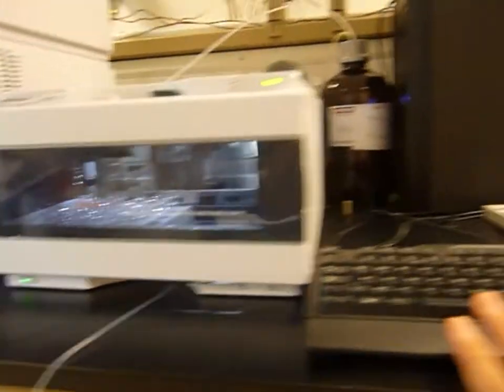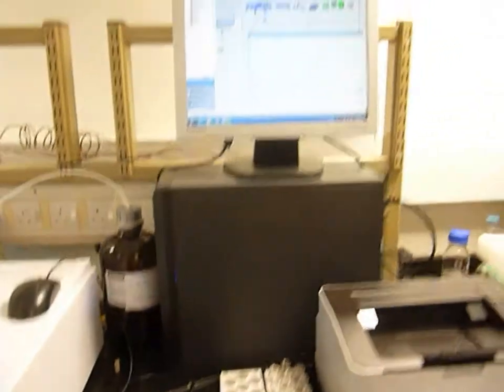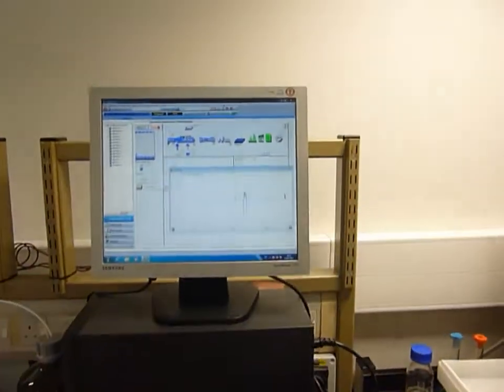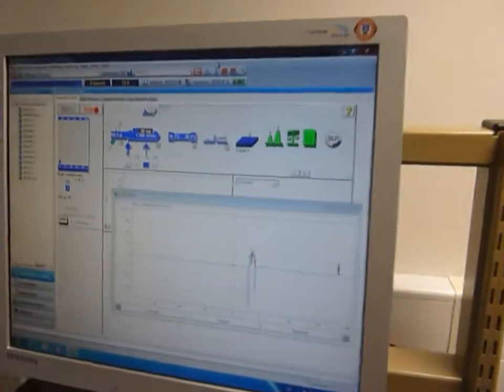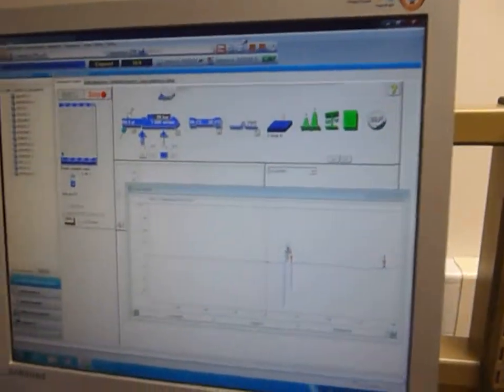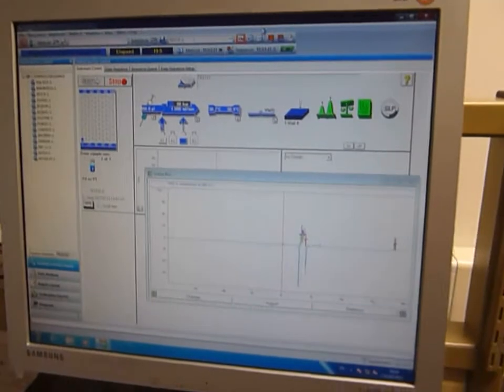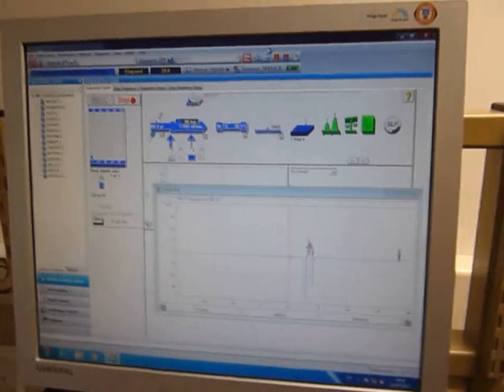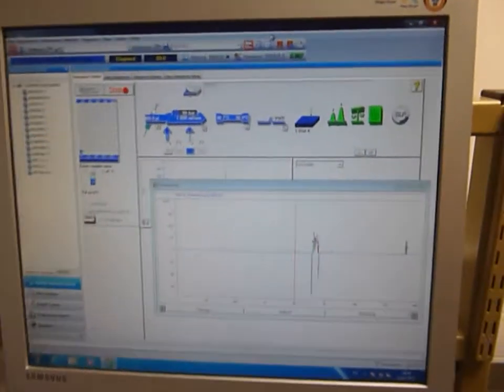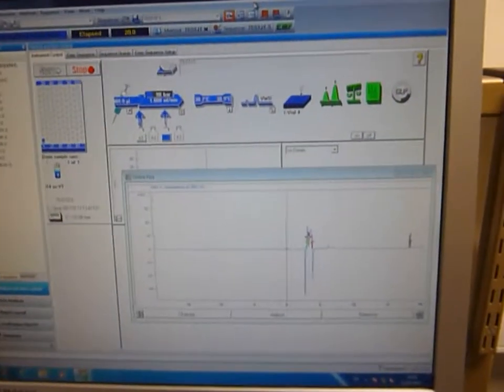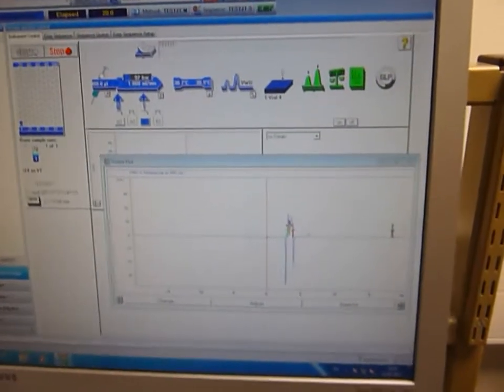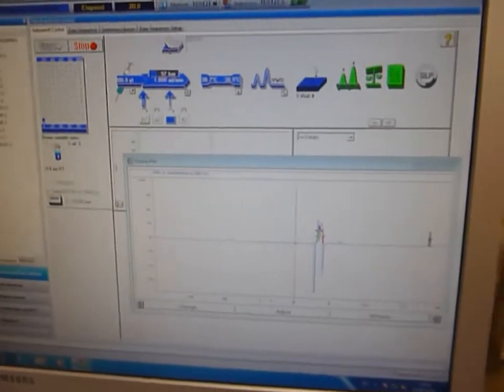So you can see here, this is the actual software that's running, ChemStation software. I've been working 40 odd years on this and ChemStation is one of my favorites, very user friendly.